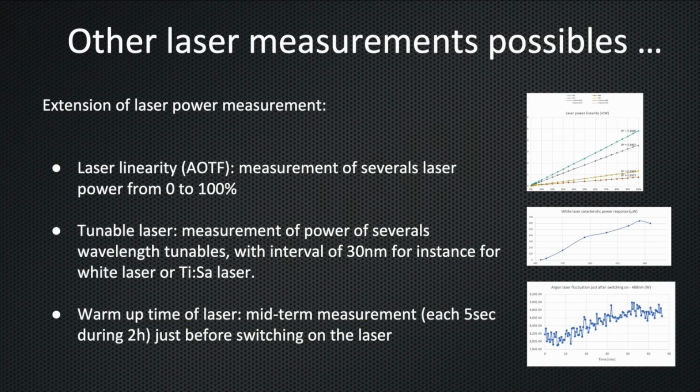For example, the linearity of a laser, and its AOTF, if applicable, can be determined by making punctual power measurements while varying the laser intensity between 0 and 100%. A linear regression fit of the plot can give us the linearity of the laser.